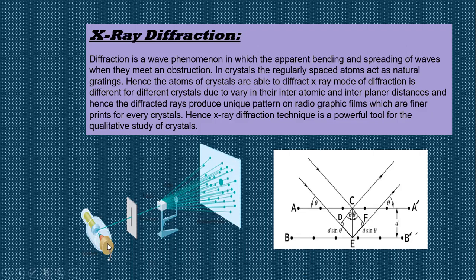First one is a beam of light passed into a slit, and then we see different patterns, meaning constructive interference as well as destructive interference. Here, two rays are reflecting on the plane, and they are reflected.